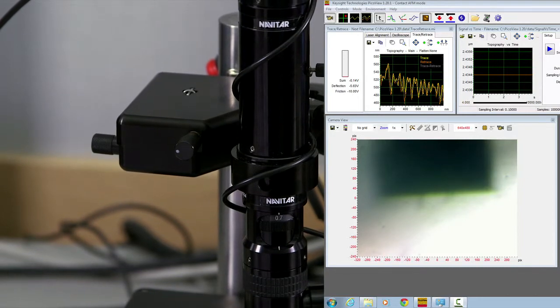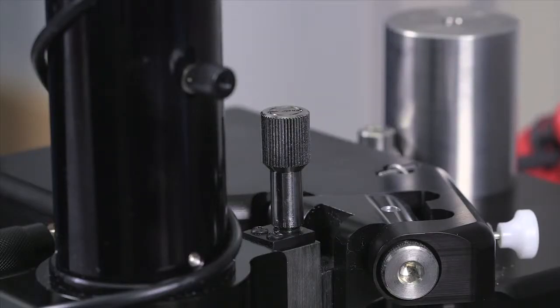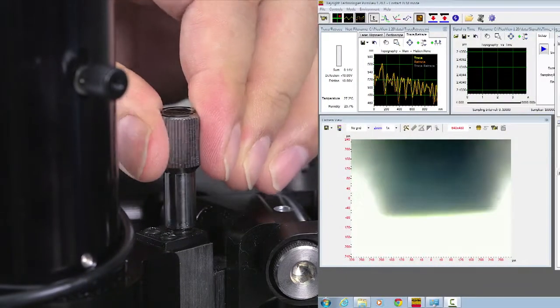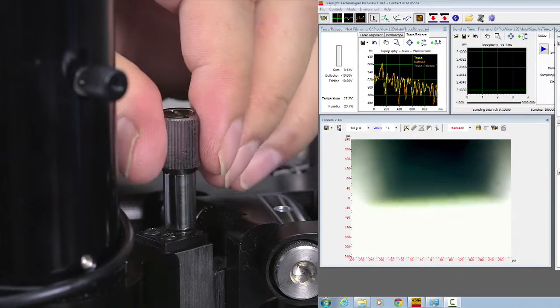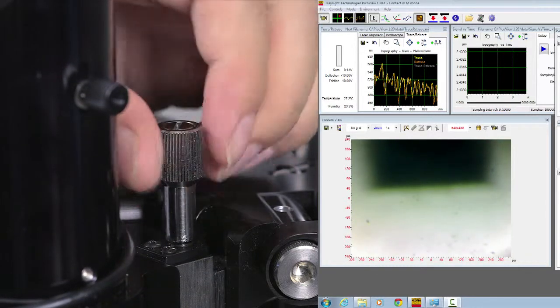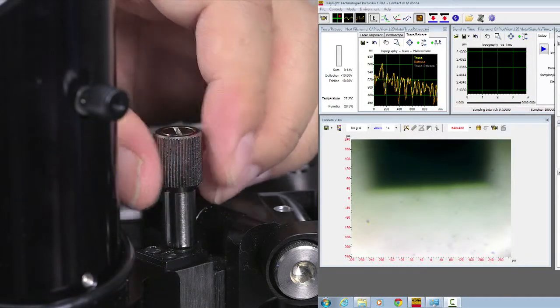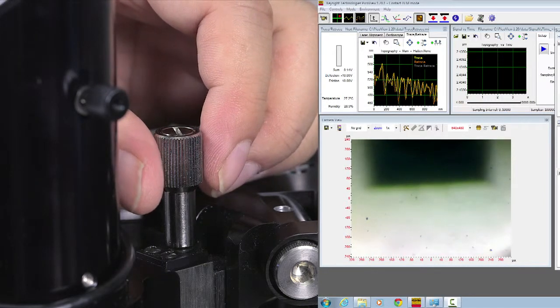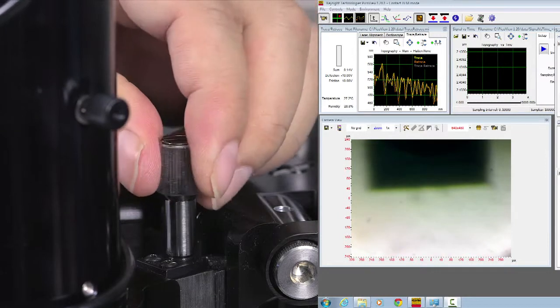Next is the focus. The focus adjustment knob is behind the optical microscope. You can rotate clockwise and counterclockwise to move the entire AFM optical microscope body up and down. Now, when you take that adjustment, also look at the computer screen, the optical view in order to help you to focus.